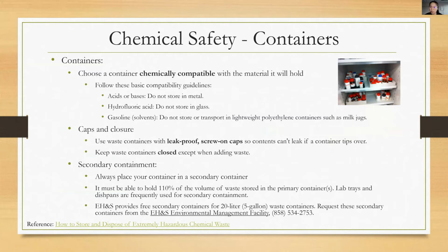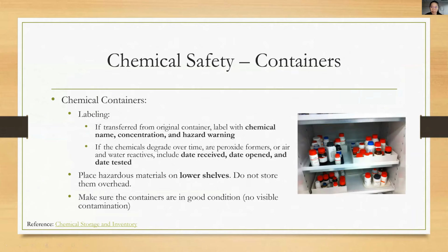And another thing to be noticed about chemical safety is the containers. So the containers first need to be chemically compatible, and second, they need to be closed when not in use. And sometimes some chemicals require a secondary container. So please take notice of that.